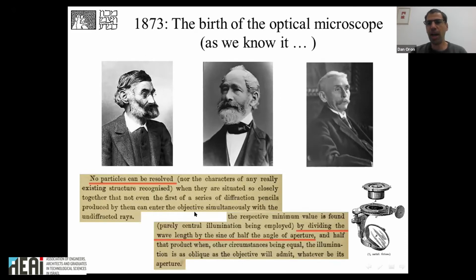And this basically set the foundation for the realization that the optical microscope is not limited in resolution due to technicalities. It's limited fundamentally because of the wave nature of light. And the resolution barrier is about half the wavelength, give or take, depending on the refractive index of the medium.